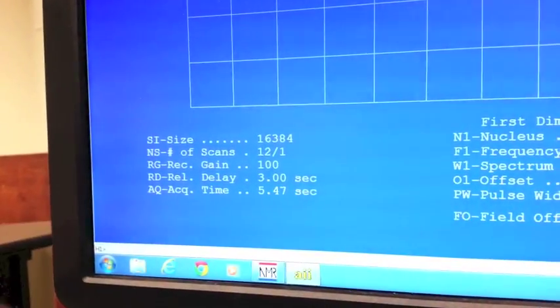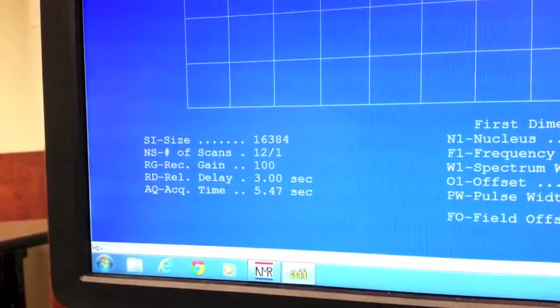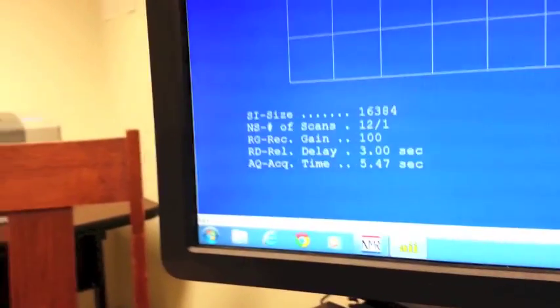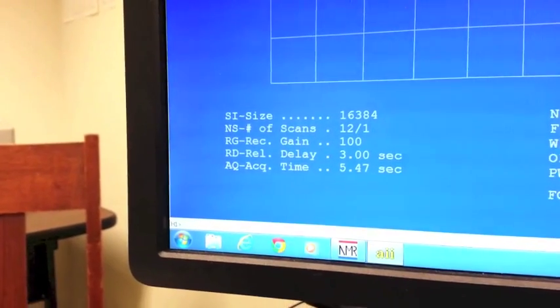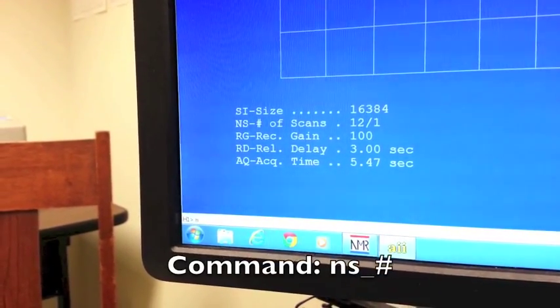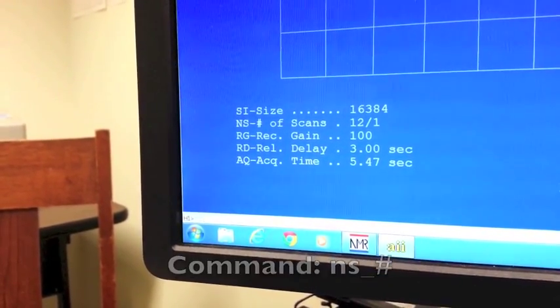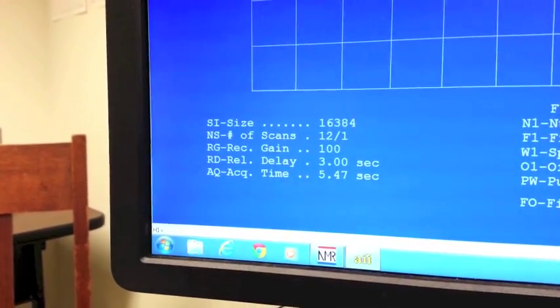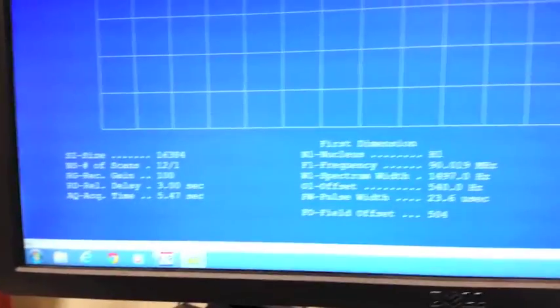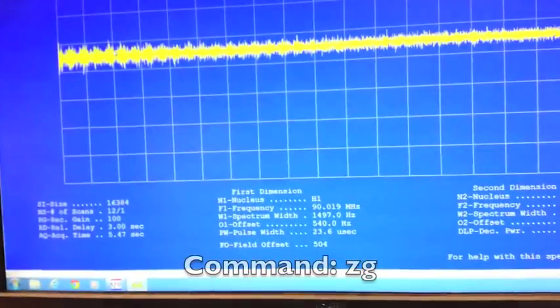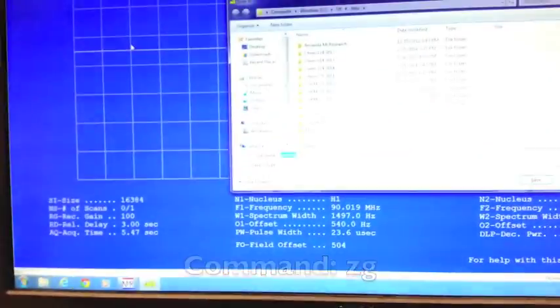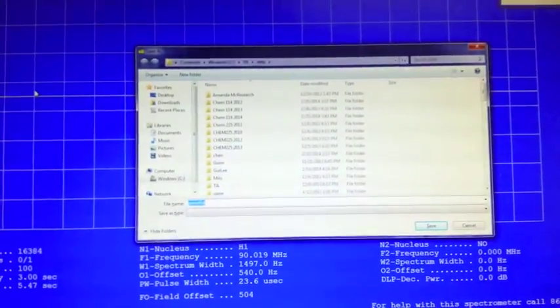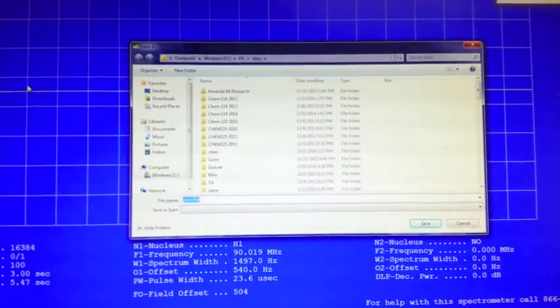Because of that, I want to make sure that I'm only going to take one scan just to test it out. So I'm going to change the number of scans to 1. To do that, I'm going to type in NS space 1 and enter. So now it will only take one scan. To take your scan, you want to type in ZG and enter. When the box pops up, again, name your sample as something that you'll be able to remember.